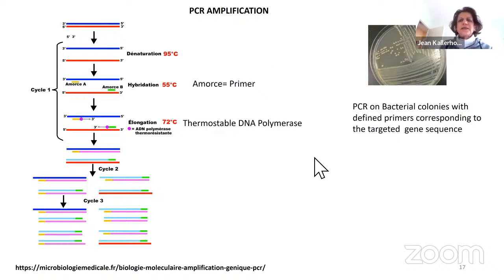Okay. Yes, thank you for asking this question. So the PCR steps, in order to get enough material, we need to make at least 30 cycles. And 30 to 40 cycles will take you about 3 hours. And these steps are very short.